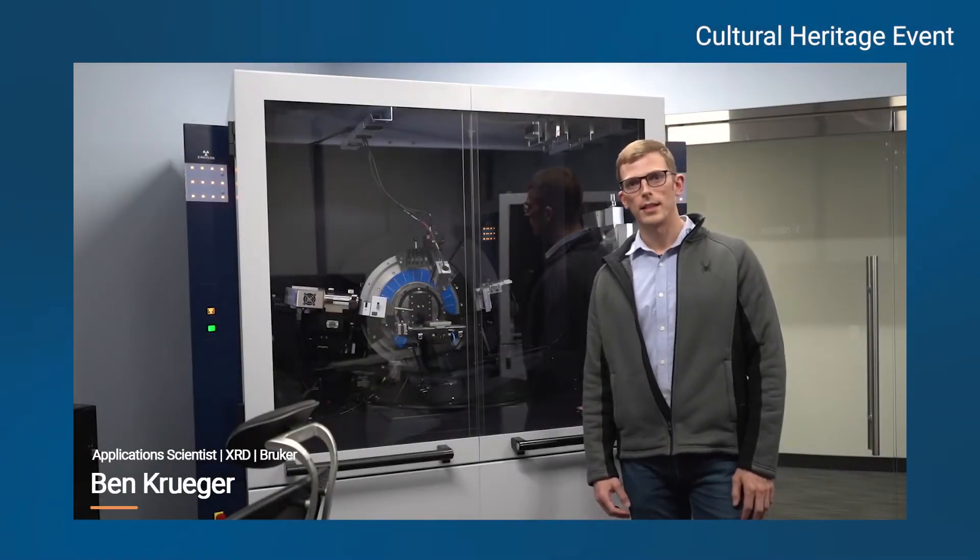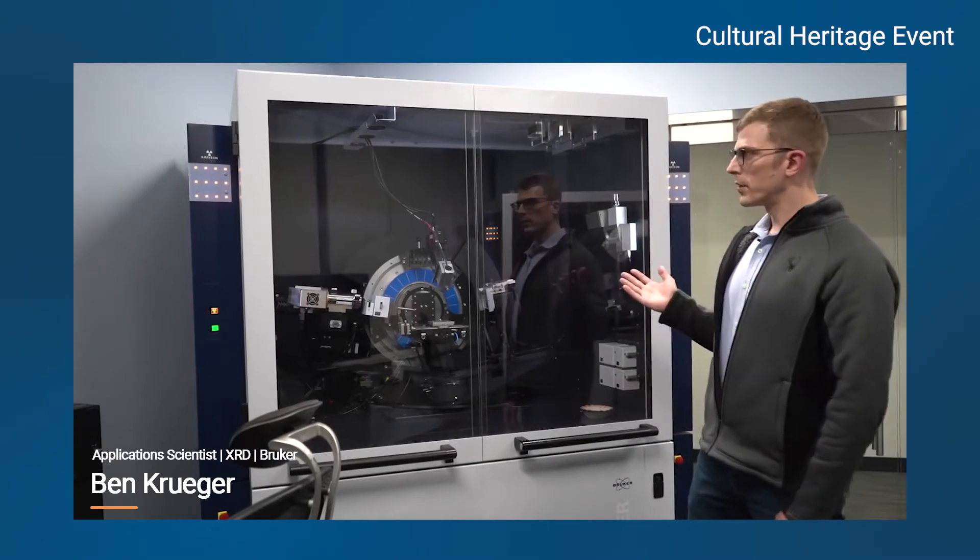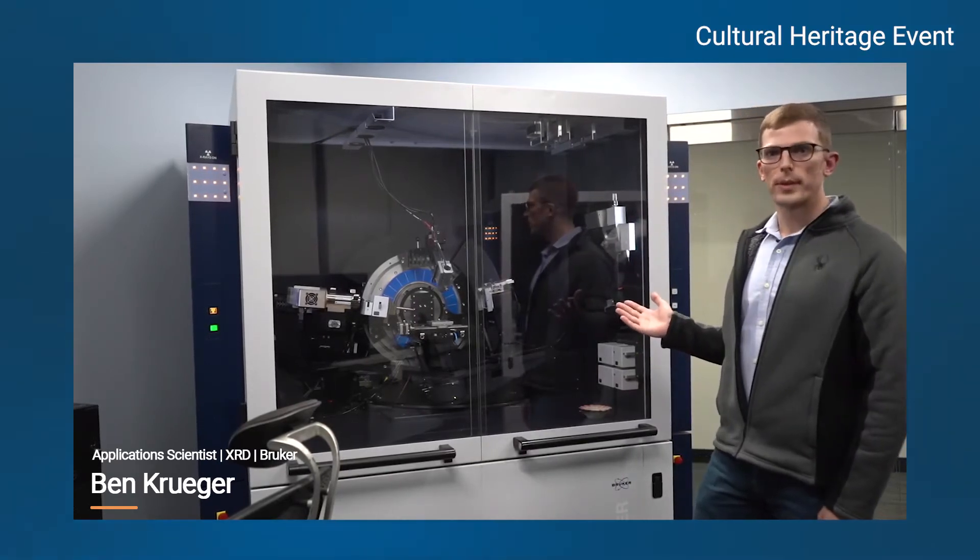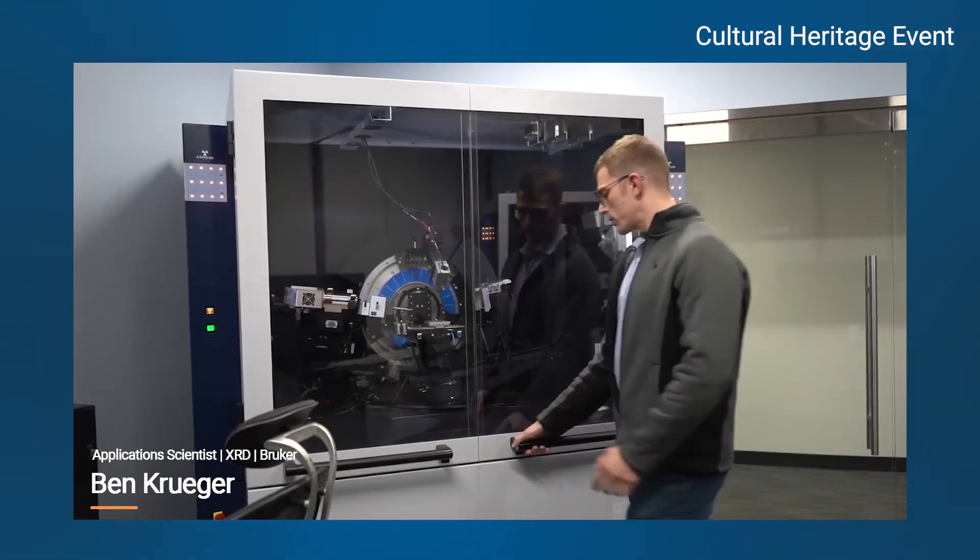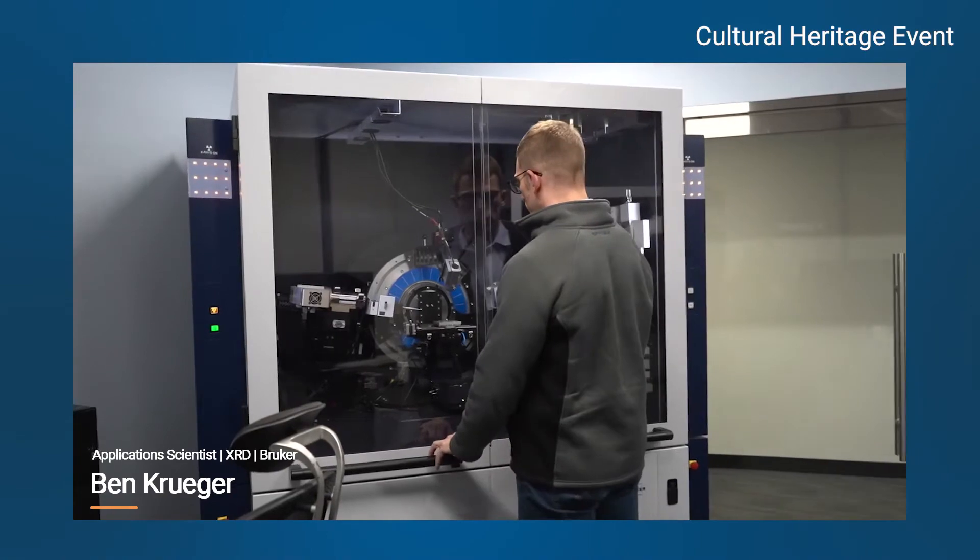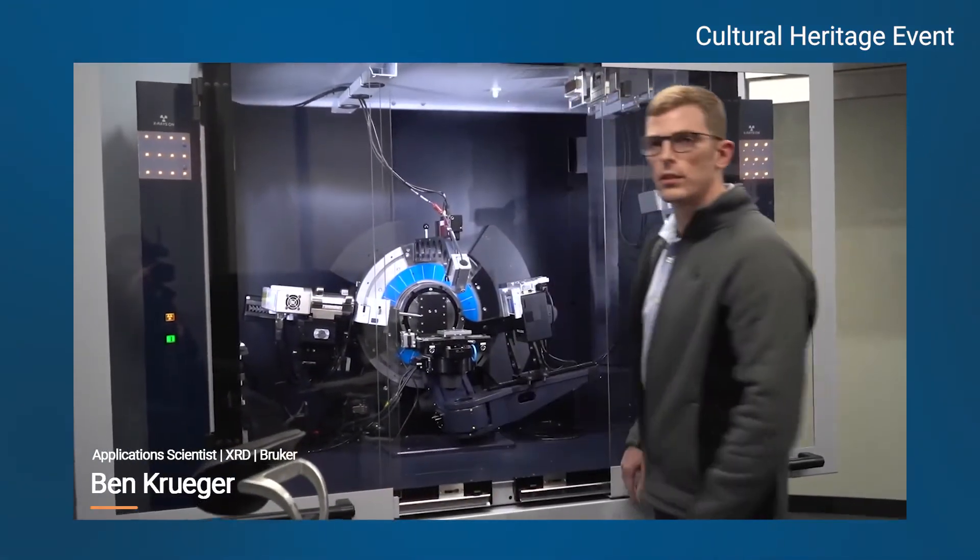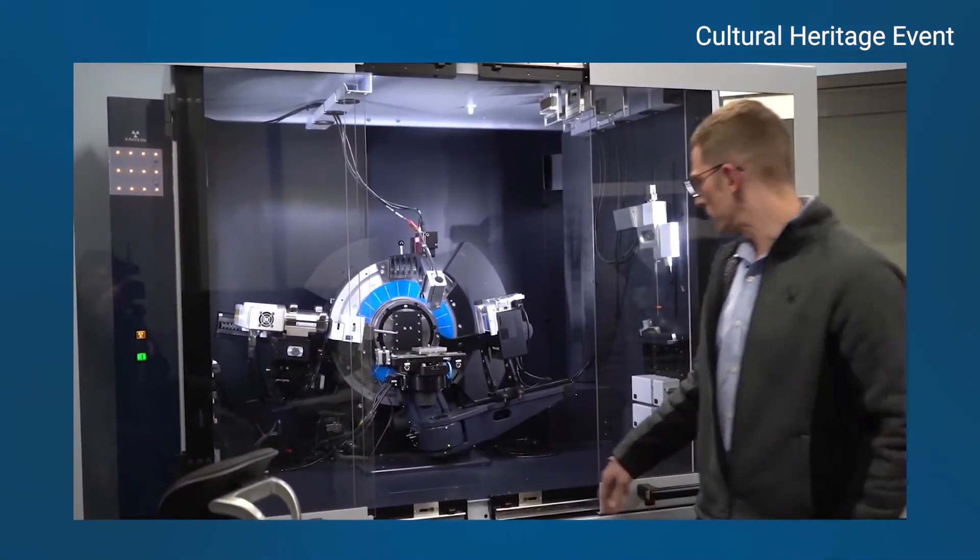Hi, welcome to the XRD lab. This is one of our XRD instruments. It's one of our larger instruments, and this particular instrument has some features which are very useful for the study of cultural artifacts, as I'll explain.